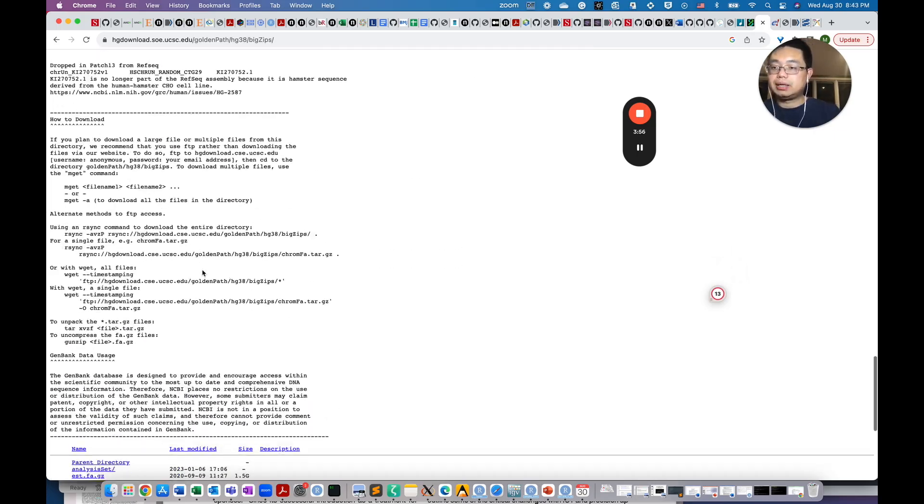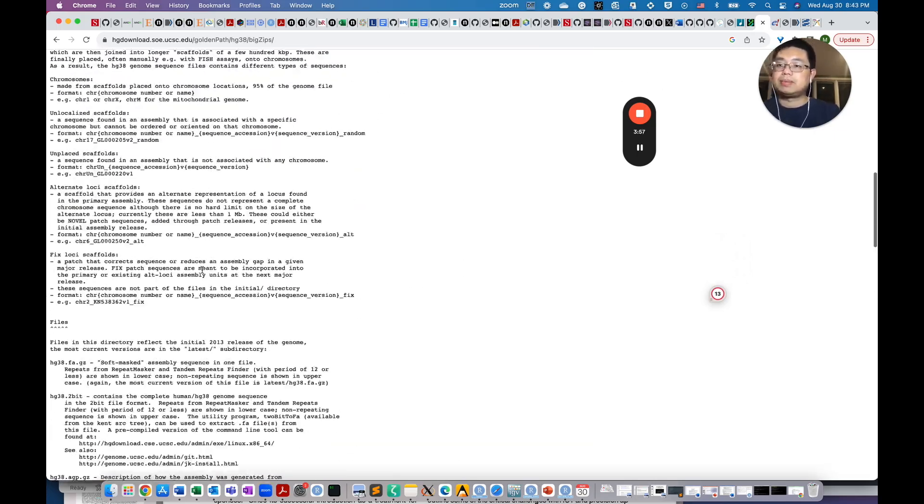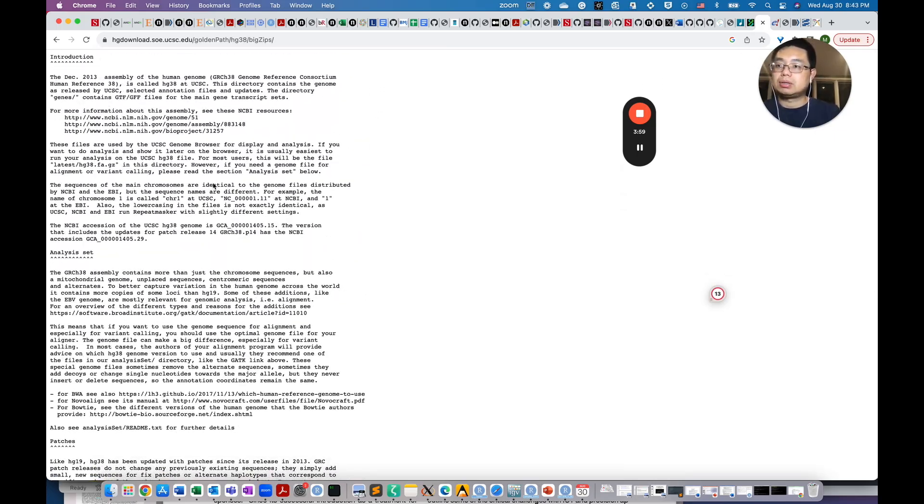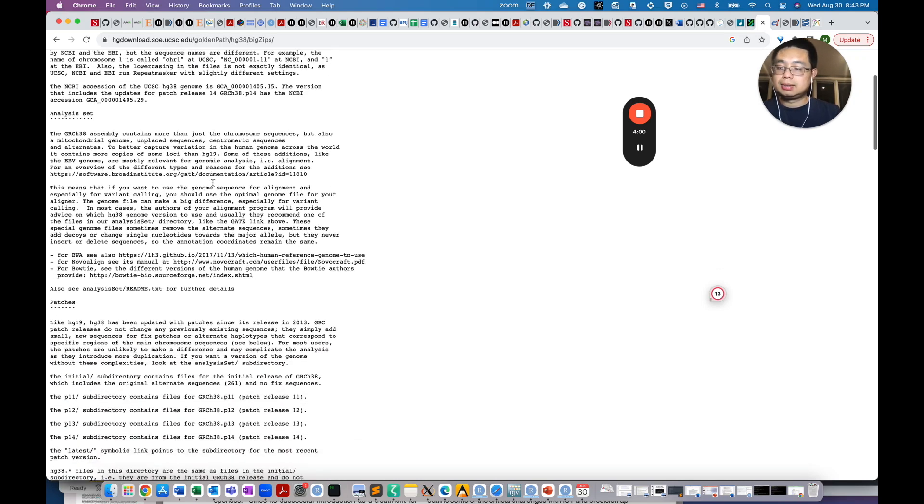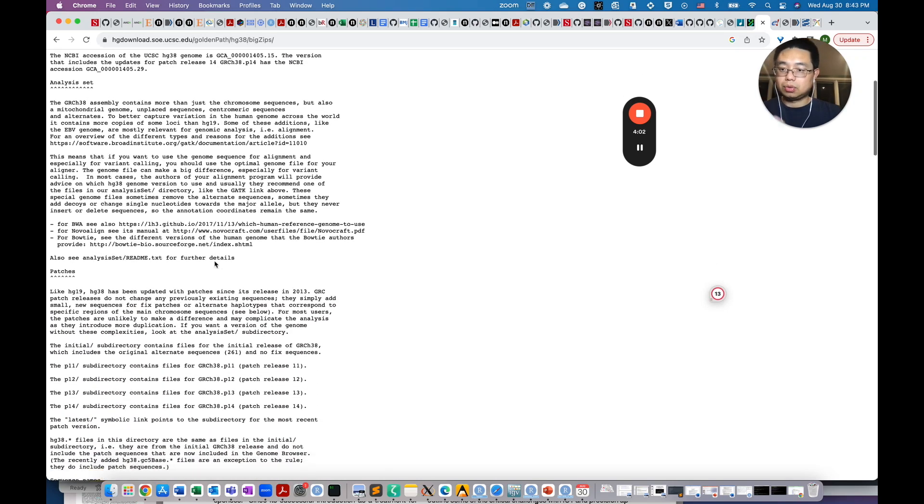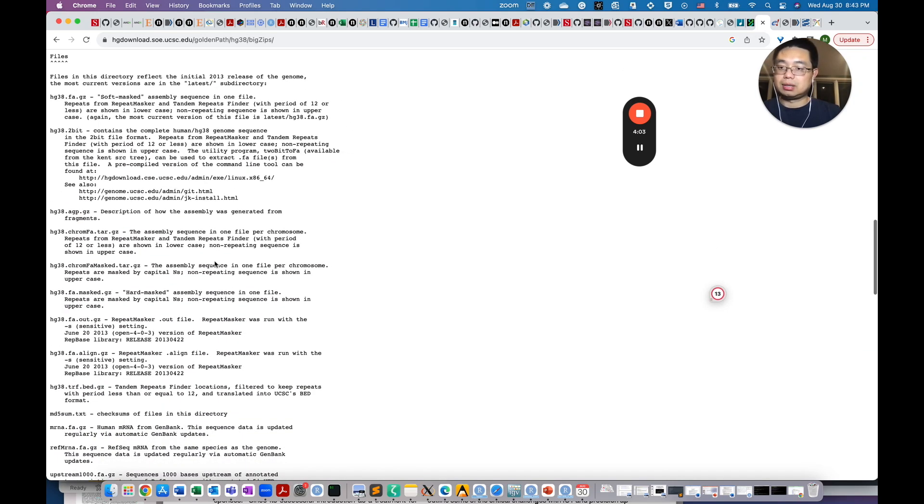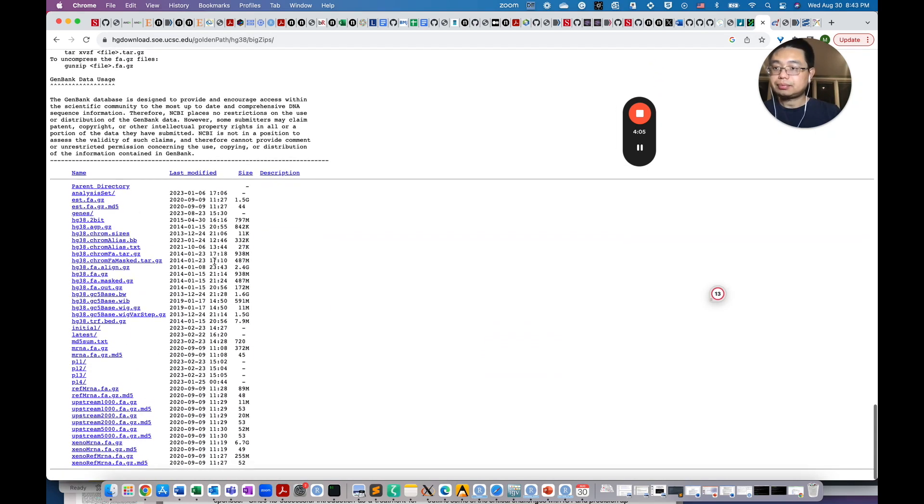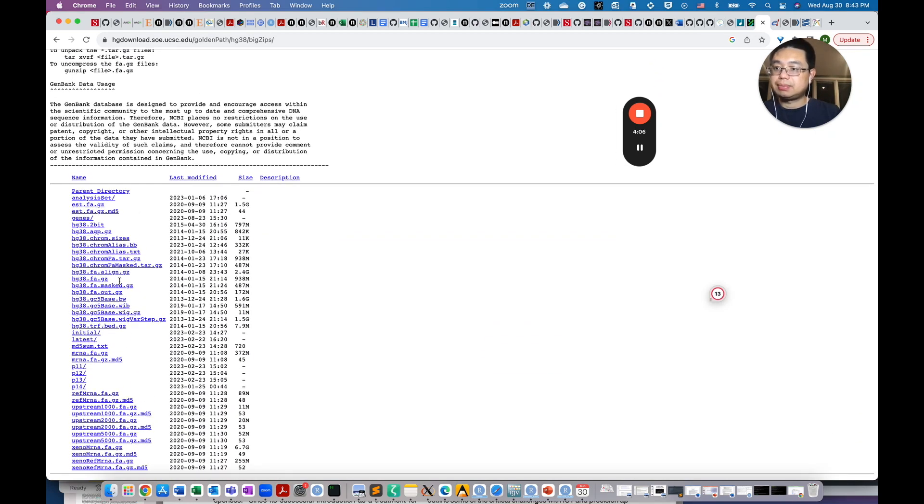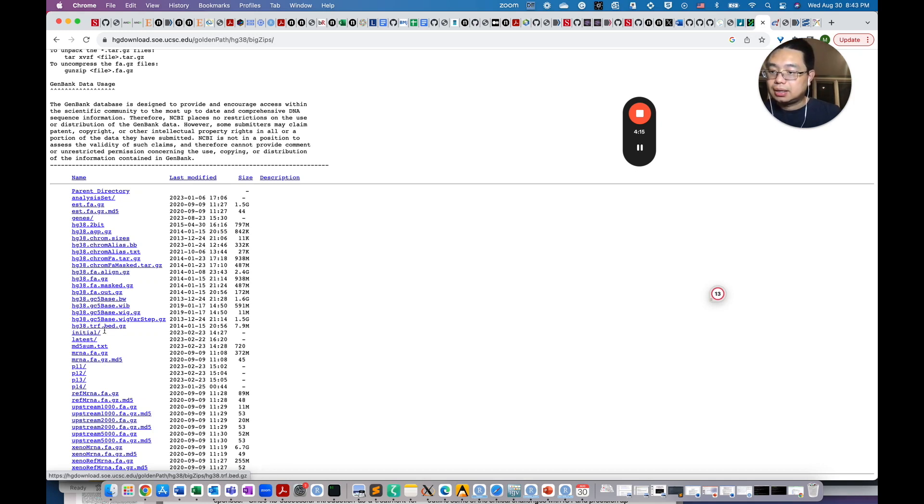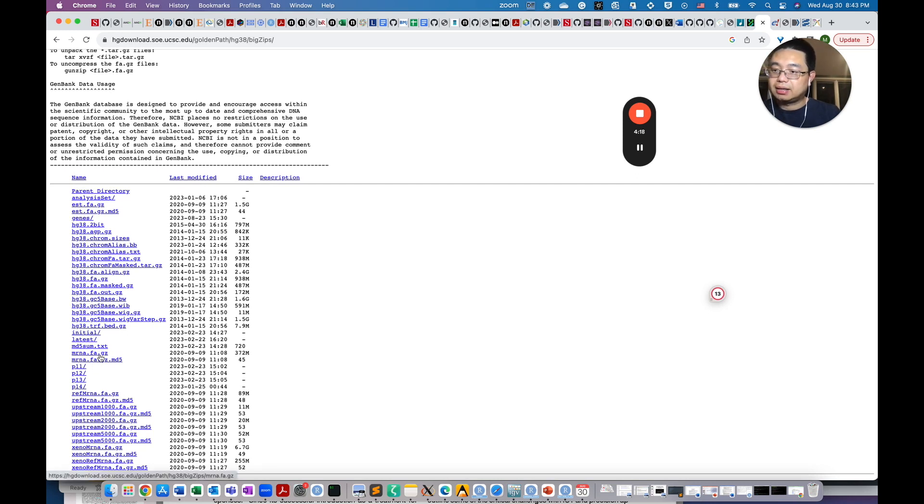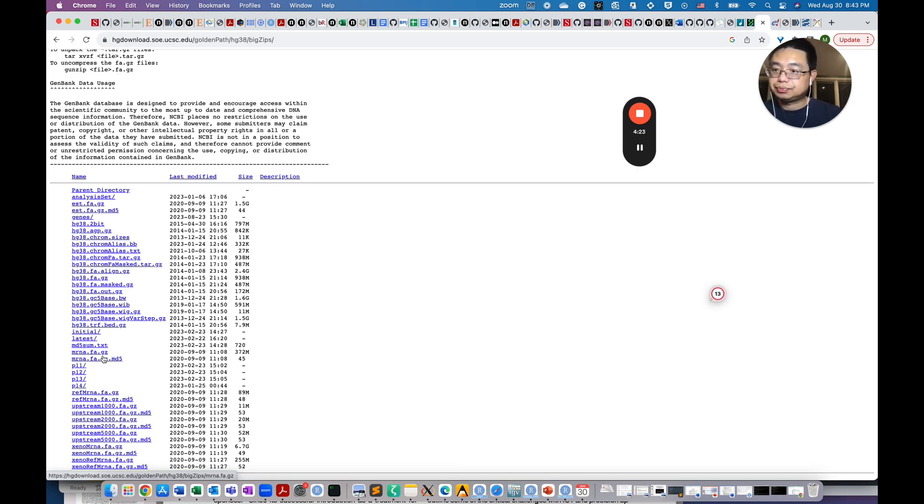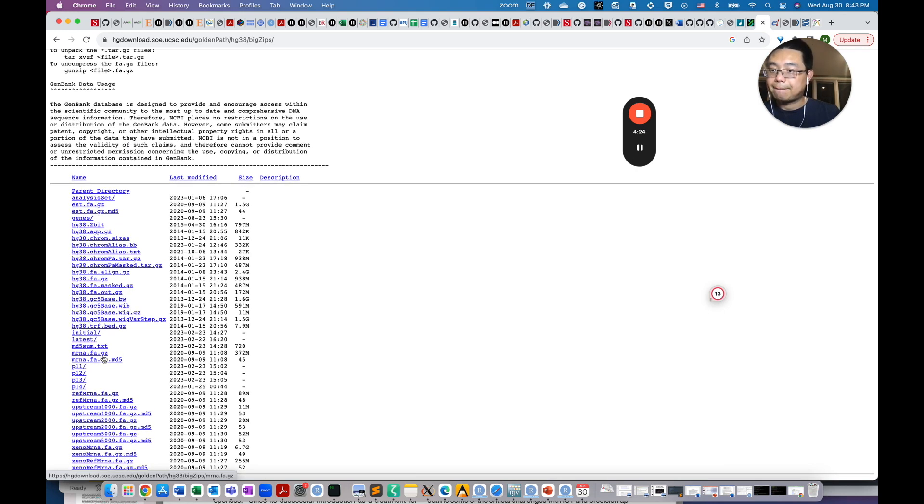If you scroll down, for example, by the way, here in the beginning, those are the readme to explain what's the differences or what are those files here. So for example, here the HG38.fa.gz is the genome reference FASTA file. And also you have the mRNA.fa.gz file. Those are the transcriptome FASTA file.